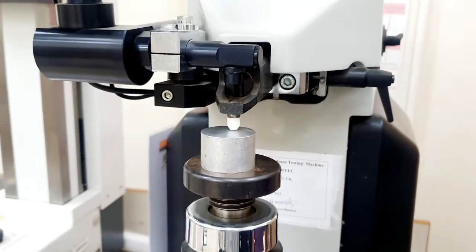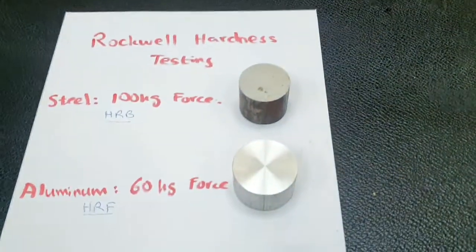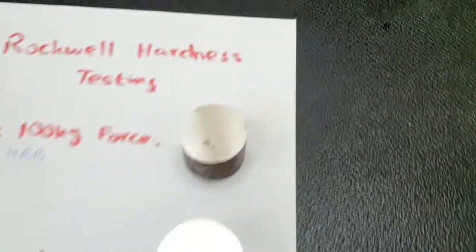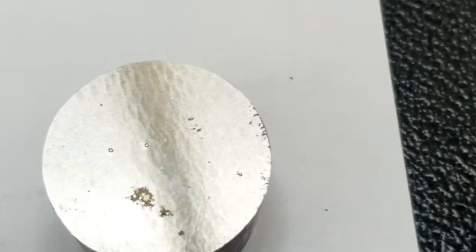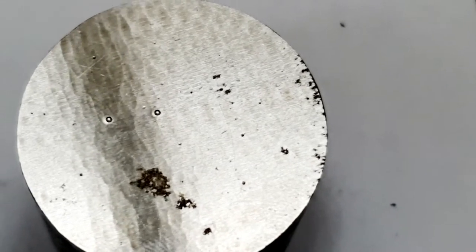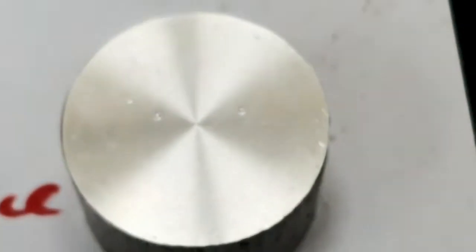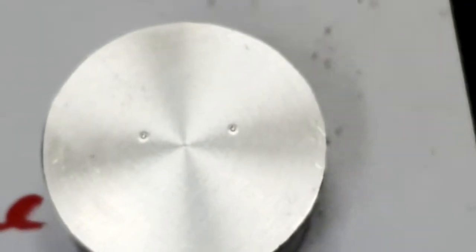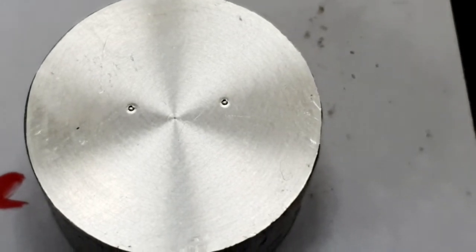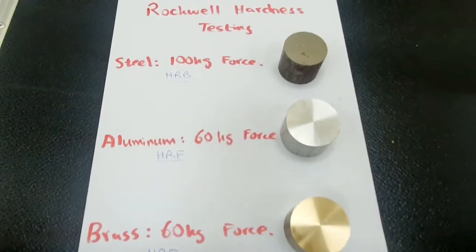Let's have a look at the indentation marks for all three of them. These are the three samples measured for Rockwell hardness testing. We can see the indentation marks are very small, but the hardness value is automatically measured by the machine. This was the steel sample. Now looking at the aluminum sample — you can see the aluminum indentation marks — and this is the brass sample. We have now completed the Rockwell hardness testing. Thank you.